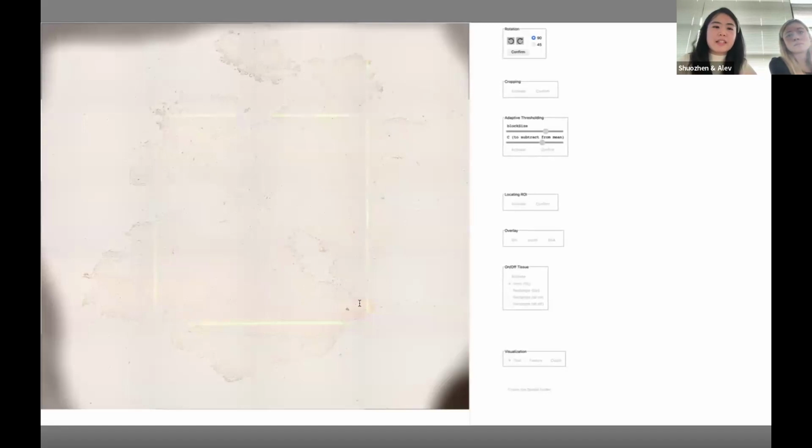So here we can see this is a wide field and a fluorescent imaging overlay together to give us the overall region of interest that our barcode A and B flow through. Based on your tissue scan, sometimes you might flip it while you're loading the samples. Sometimes you might add it in the wrong way. For example, you constantly add your sample on the left inlet and then flow the right one, and then you flip it. You can adjust it at this step.